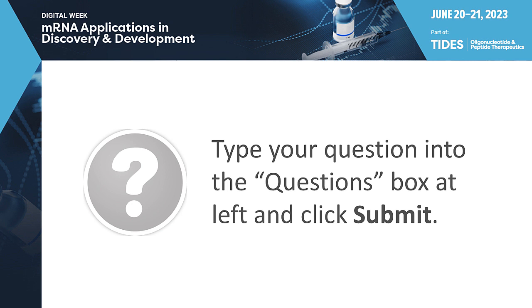Can CIMac PrimaS distinguish between capped and uncapped mRNA? Not in the way presented today, but we have developed an assay which makes use of exonuclease digestion that is selective for capped versus uncapped RNA. If we digest down the RNA with exonuclease, we're only left with capped RNA, and so by subtraction, we can work out the relative amount of capped mRNA. This is published in one of the publications that I refer to, or reach out to me for more details later.